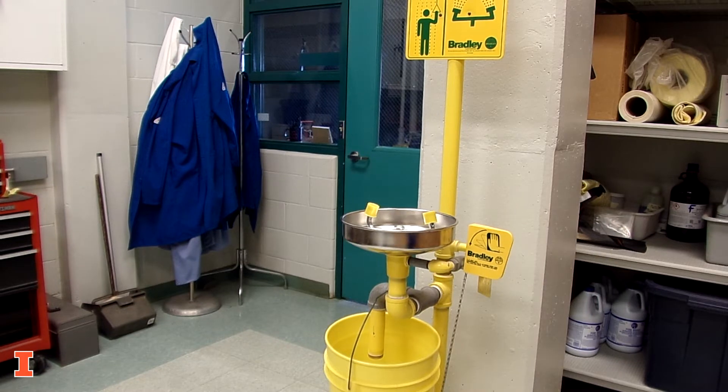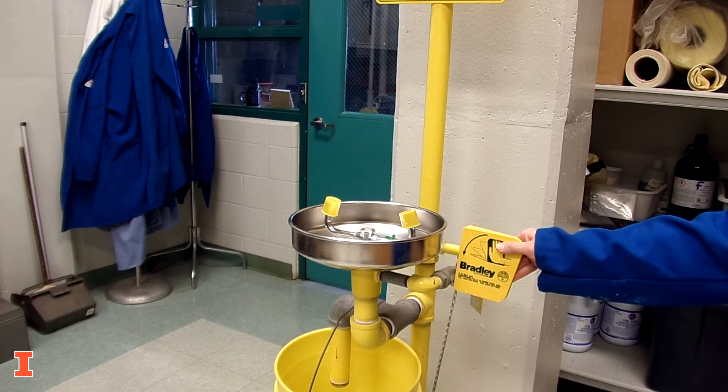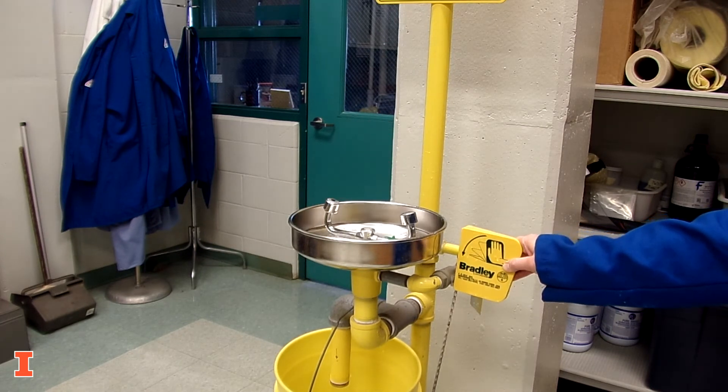If the eyewash is not connected to a drain, use a bucket to catch the water. Activate the eyewash and look for even flows coming out of both sprayers. The water streams should intersect in the middle.